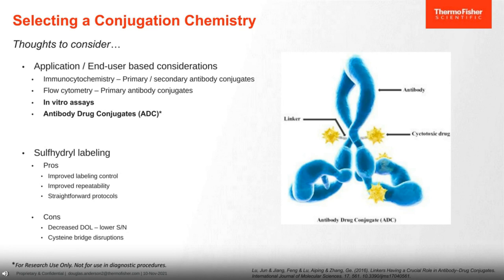And it's also great if you're trying to make a defined antibody-drug conjugate where repeatability is quite important, and maybe you're not putting a fluorophore, you're putting some kind of a drug where you only need one or two of those. So this is a great method if you need that control and that repeatability above all else.